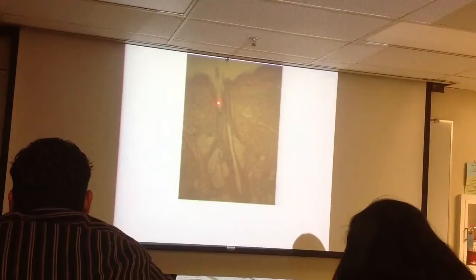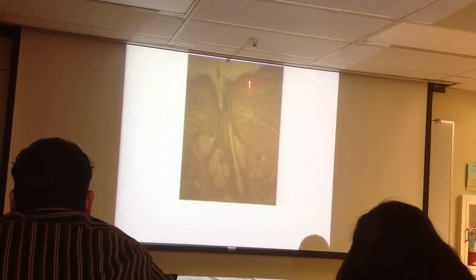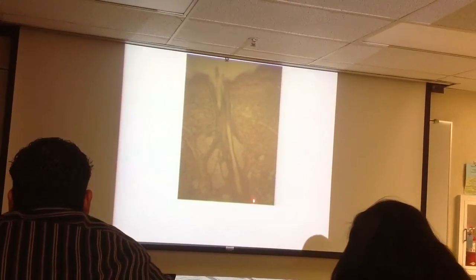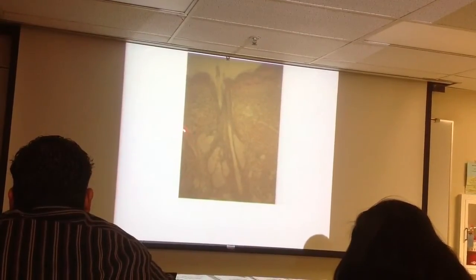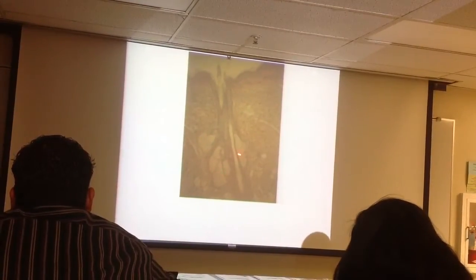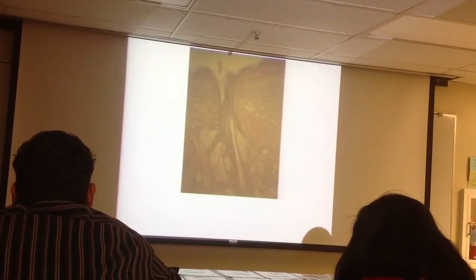What's that? Hair shaft. What's the dark part down here? Hair follicle. What's the dark part there? Epidermis. What's all that? Dermis. What's that thing? Erector pili muscle. And there's one over there too. What's that? Sebaceous gland. And what organ is that? Skin.